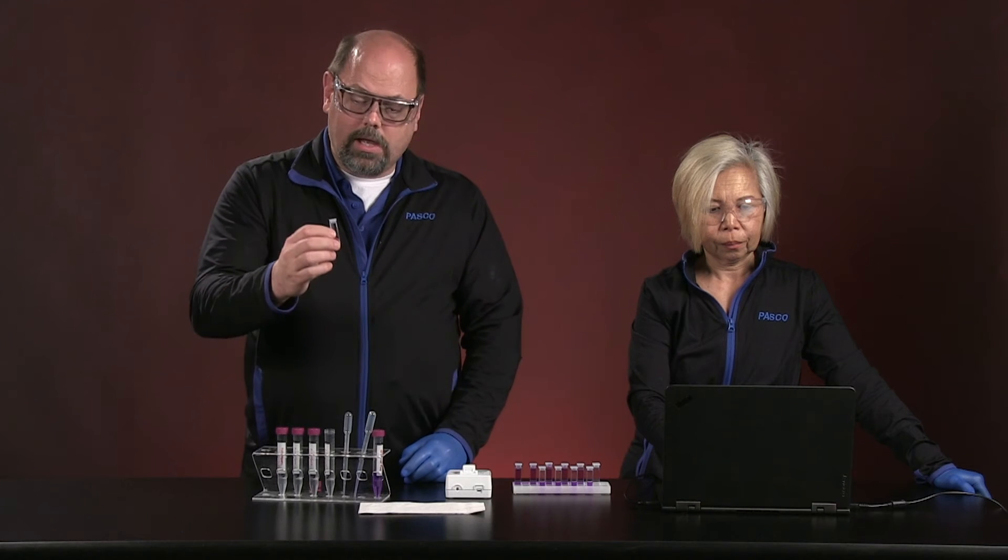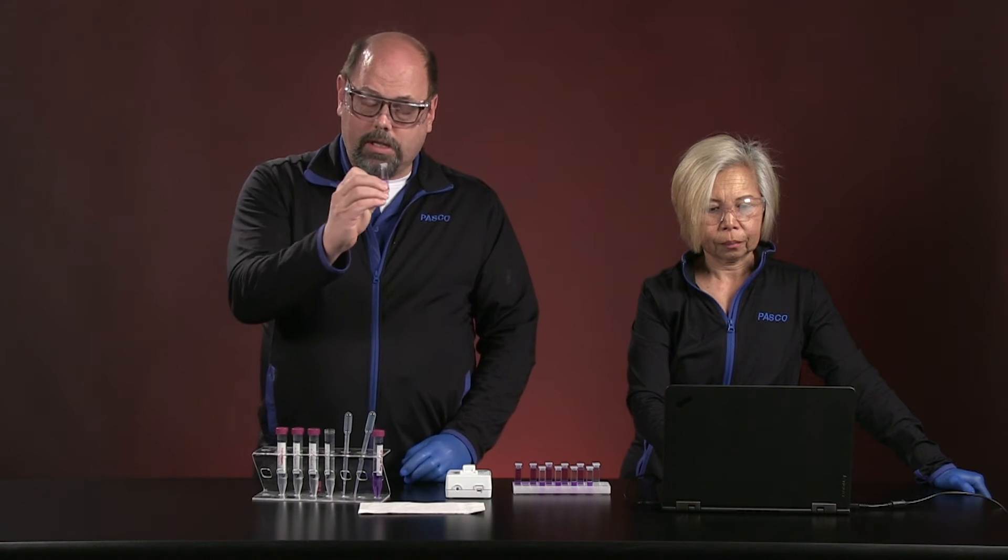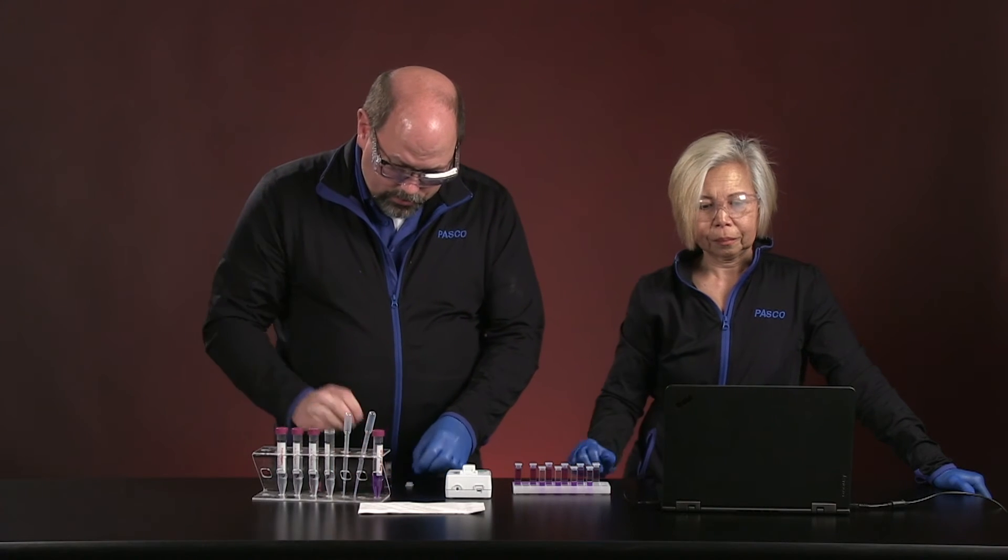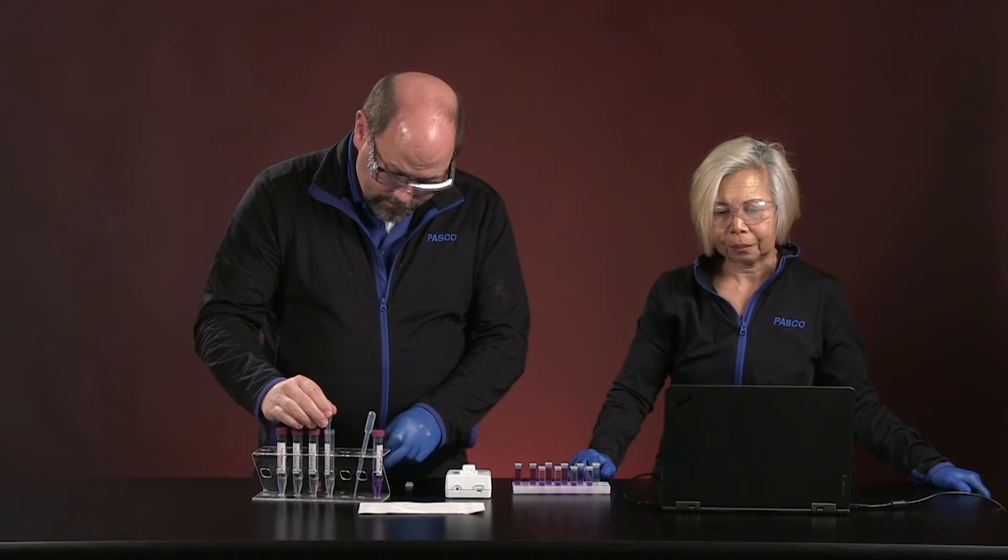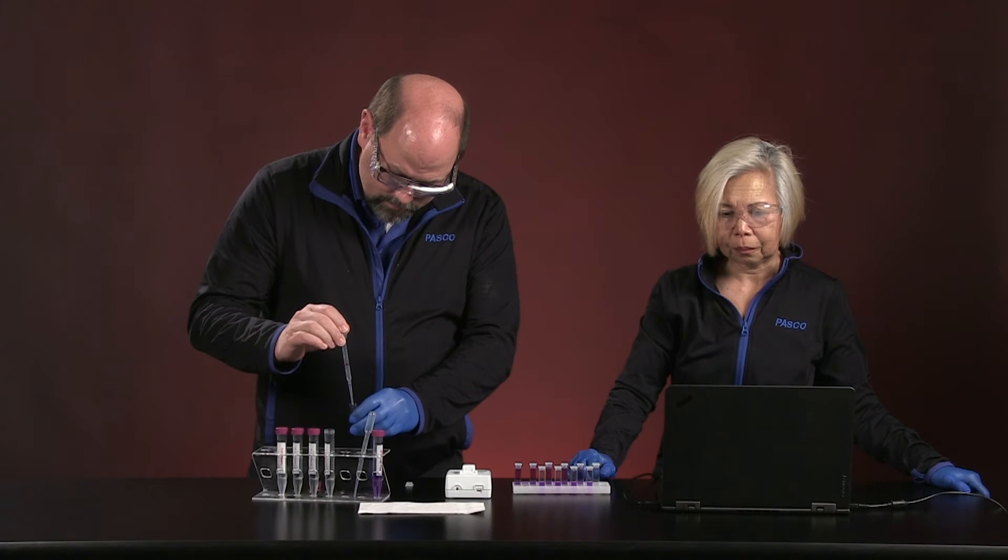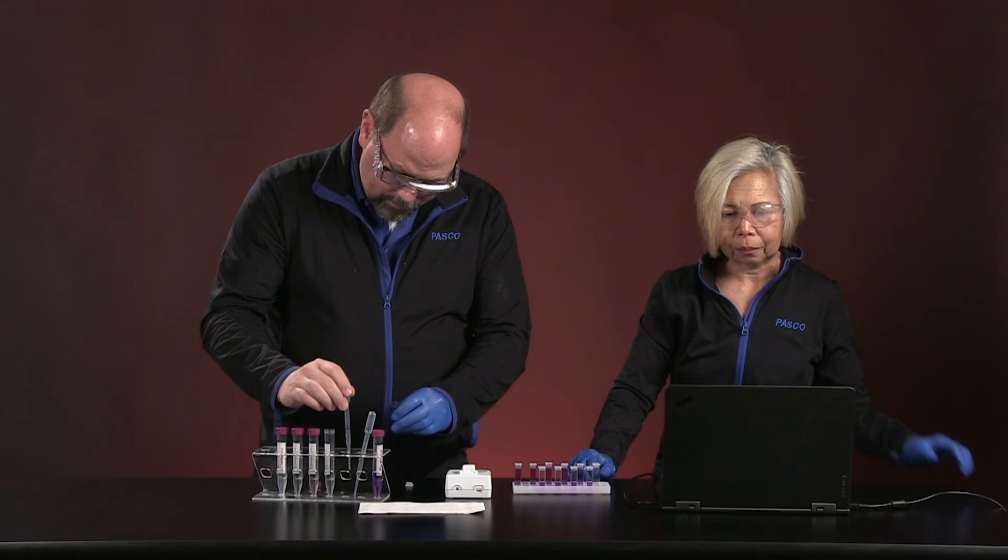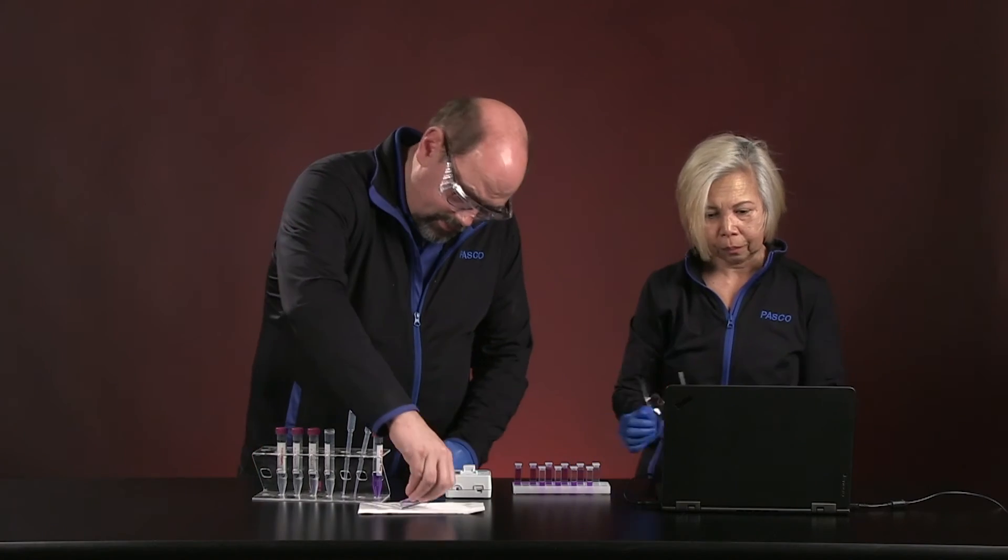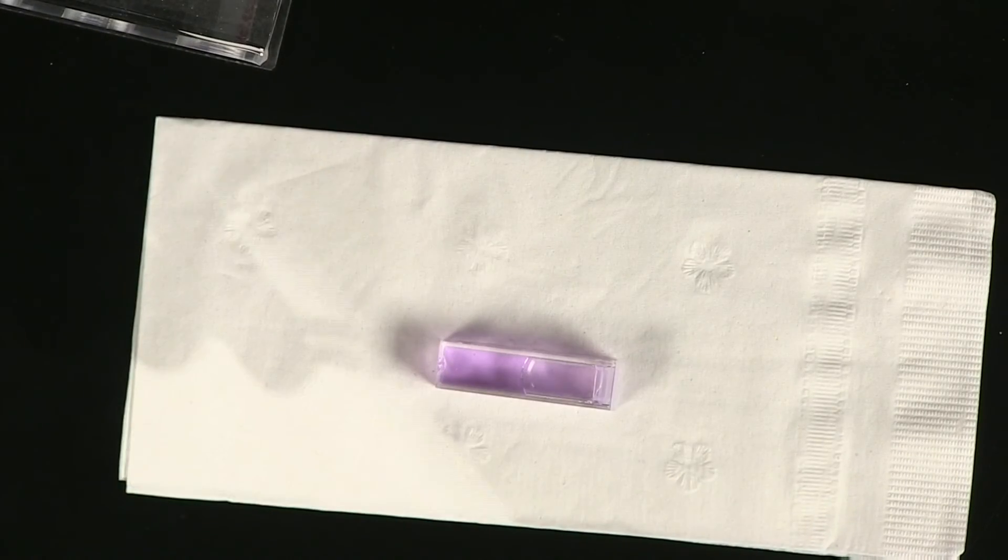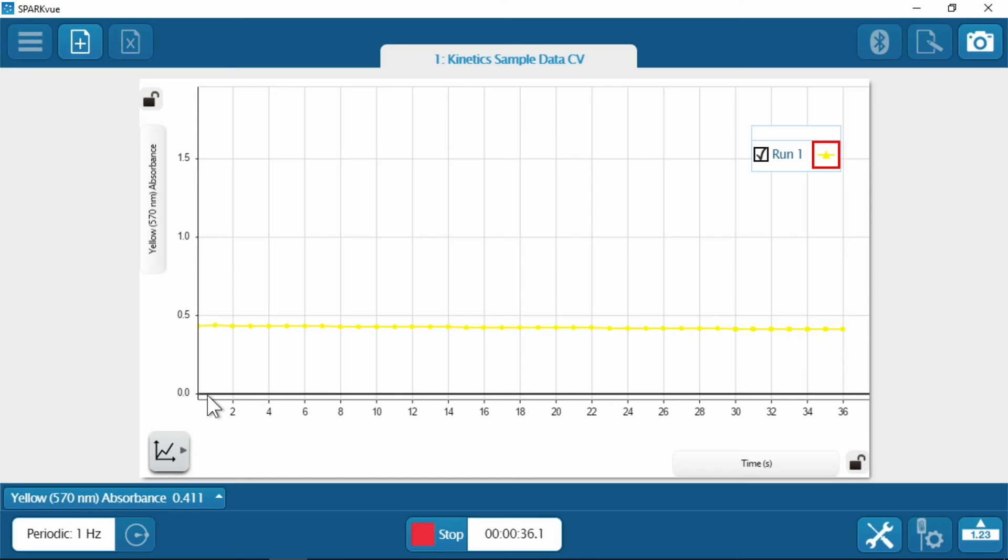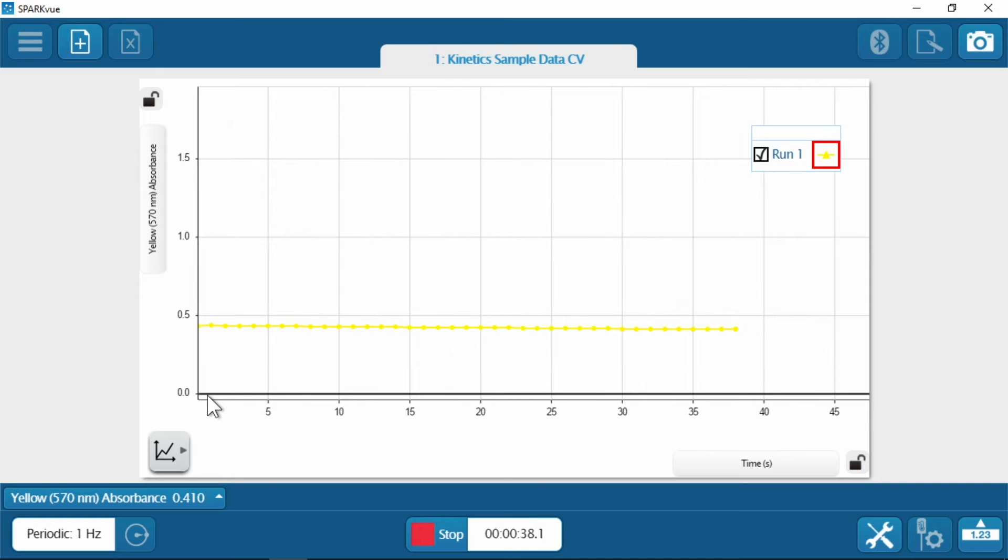Now, to give you a feeling while that's going, I'm going to do this also in the video camera. And you can watch to see how much that takes to also lose its coloring. So you can see that process happening in the camera as well as watching it happening on the graph. It's going down a little bit.